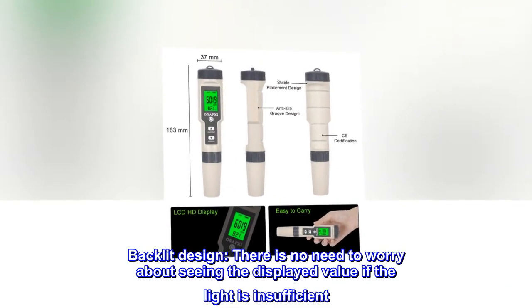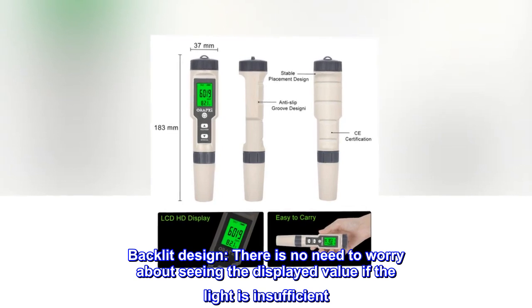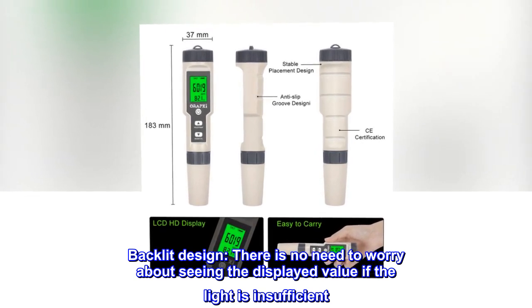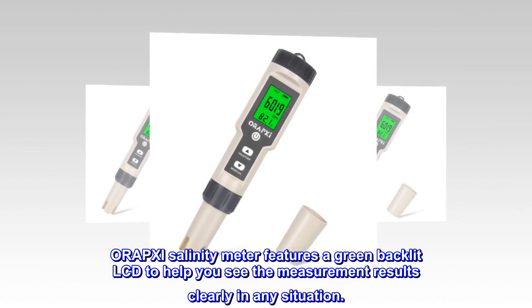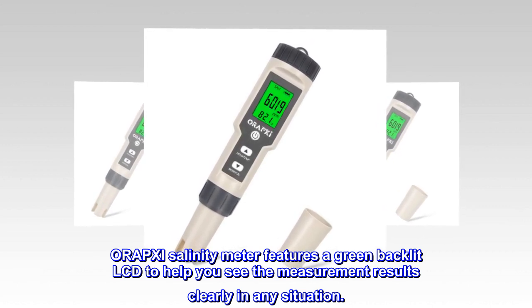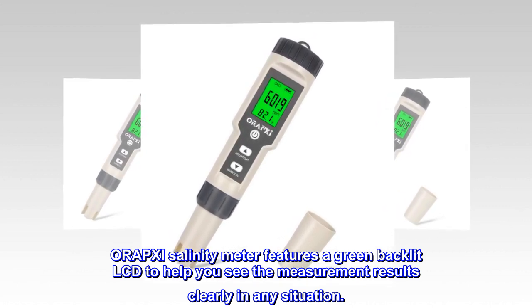Backlit design. There is no need to worry about seeing the displayed value if the light is insufficient. The ORAPXI salinity meter features a green backlit LCD to help you see the measurement results clearly in any situation.